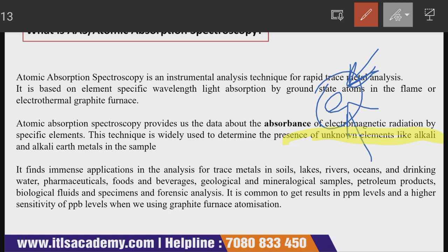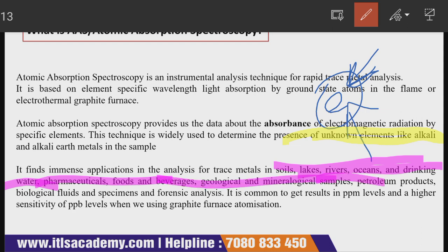This technique is very important. As you can see, I have mentioned different fields like soil, river, drinking water, pharmaceuticals, beverages. This technique has application in each field, whether it's soil, marine life, pharmaceuticals, food or beverages.